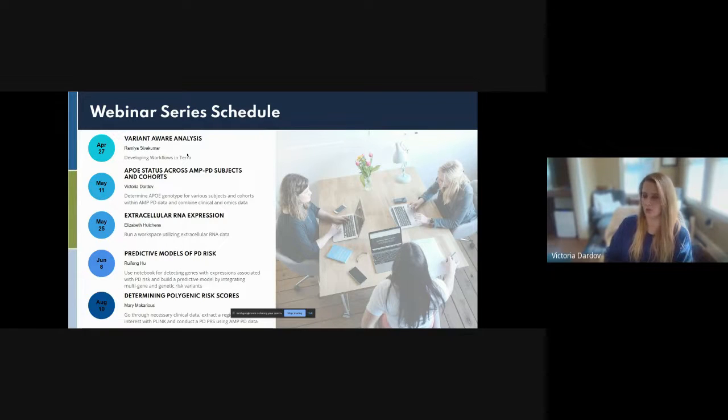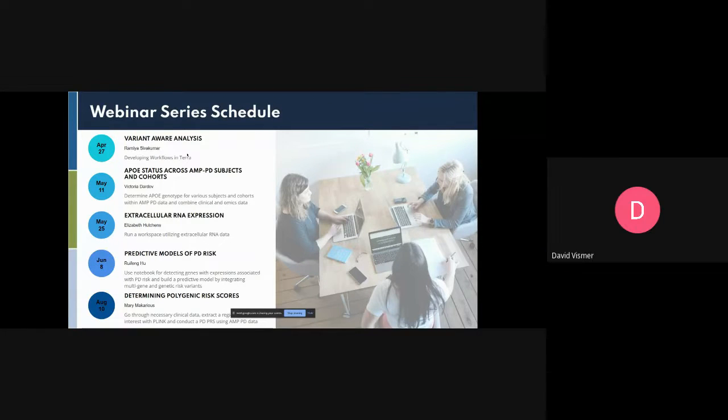So we have almost, Dave and Barry, correct me on this, but I think we have over 10,000 genome samples. And then close to that with transcriptomics and not as many proteomics, but. So yeah, we have 10,400 subjects.